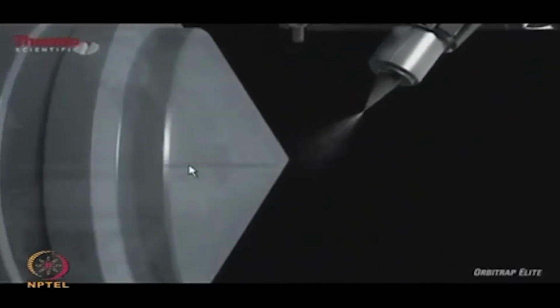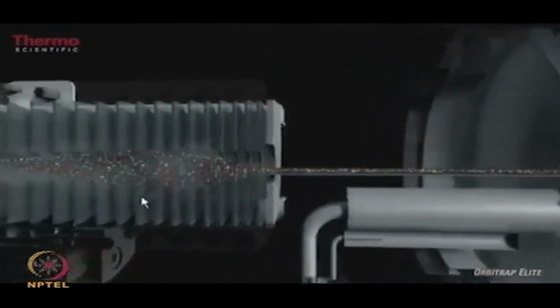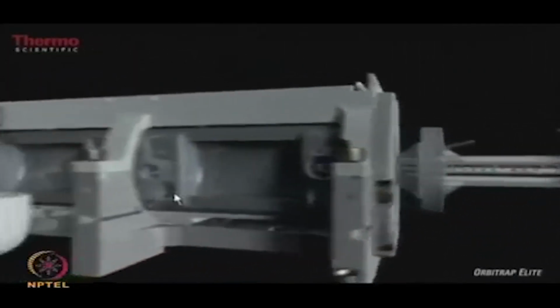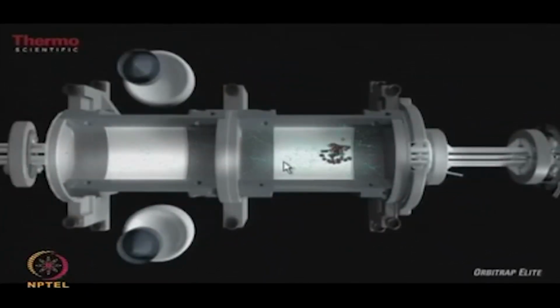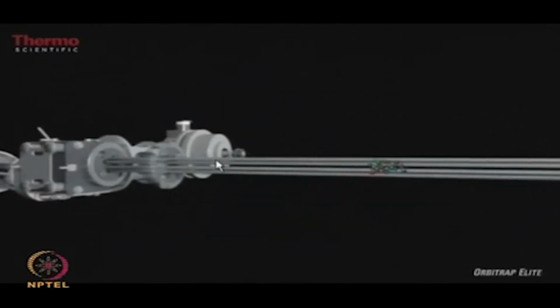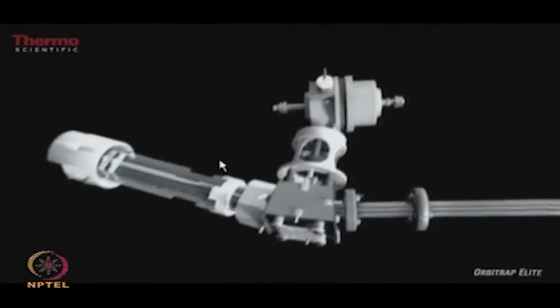So coming back to the ionization source, the ions generated from the source go into the transfer optics, and after going out from the transfer optics they go to the linear trap. In the linear trap, in a full scan mode, the ions are stored in the high pressure cell. Once these ions are stored in the high pressure cell in the full scan mode, the ions then move into the C trap through the ion transfer optics.